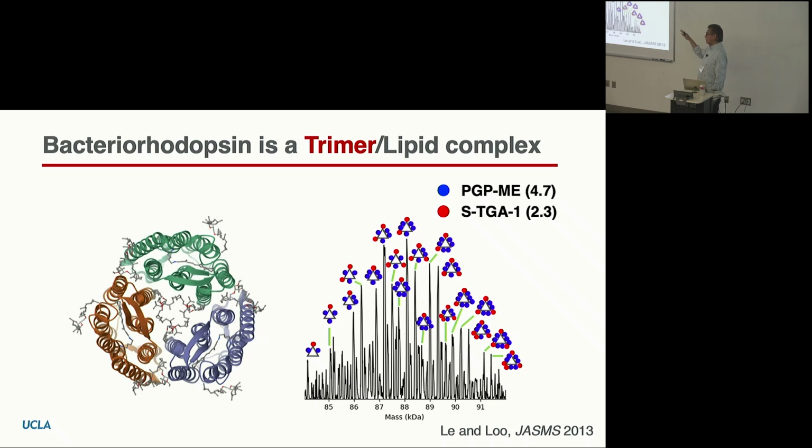They also did X-ray crystallography to confirm that lipids were bound, but they couldn't figure out exactly what lipids were there. Then these other biochemical studies, who focused on lipids, determined that these two were present, but they didn't know the stoichiometry. But they could sort of figure out from the X-ray crystallography density where the lipids might be. We make the measurements, we read the old papers, right? And we figured out, okay, these two lipids are the most prevalent ones there. And when we try to assign all the peaks, you can imagine what the raw spectrum looks like. There are peaks everywhere, right? But we tried to assign as many of these peaks as possible, and these two kept coming up as the only two lipids that were present. Now, there's some other minor stuff down here, but these are the two main ones here.